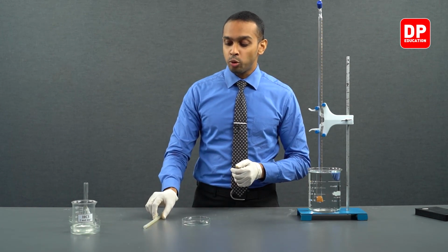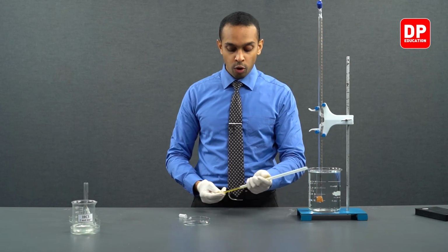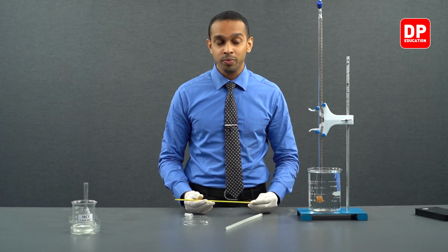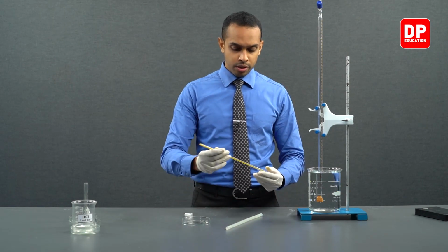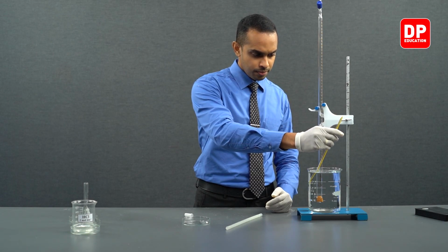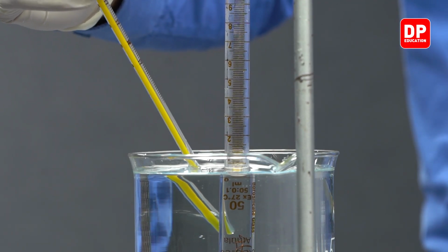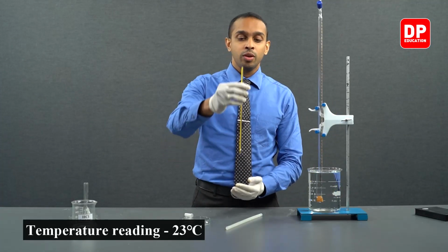Now, we have one more measurement to take, that is the temperature of this water. Because when you take the temperature of the water, we can have an understanding of the temperature of the gas here, because they come to an equilibrium where the temperature of the water and the temperature of the gas will be equal to one another. So, let's take the temperature of the water here. Temperature of the water is 23 Celsius. 23 degrees Celsius is the temperature of the water.